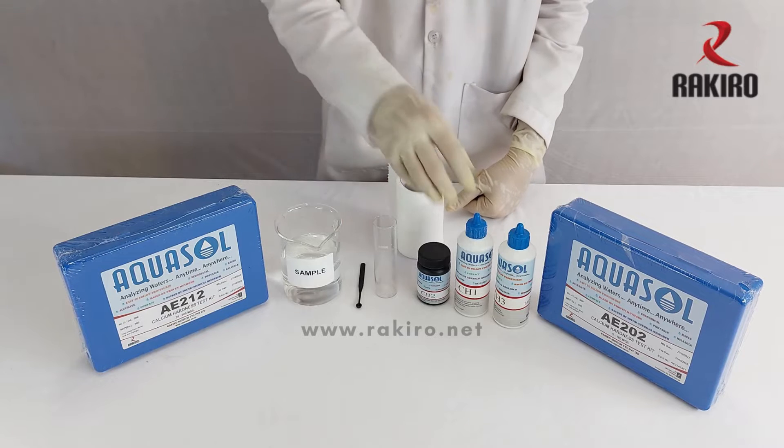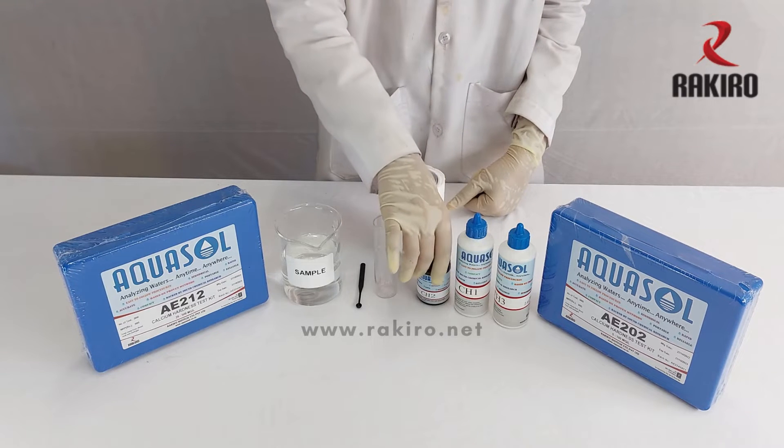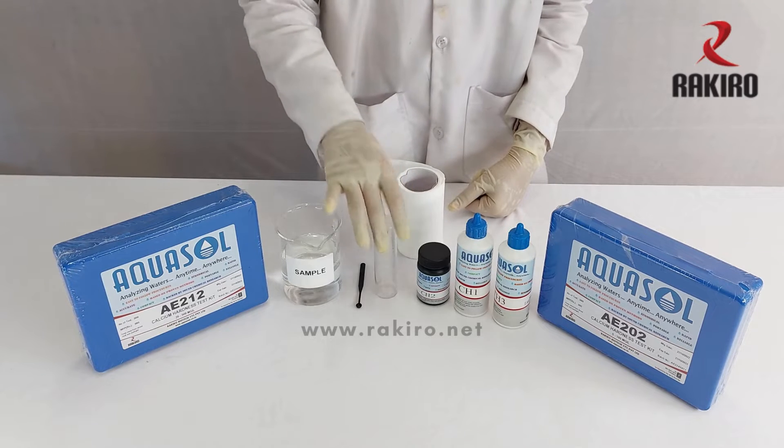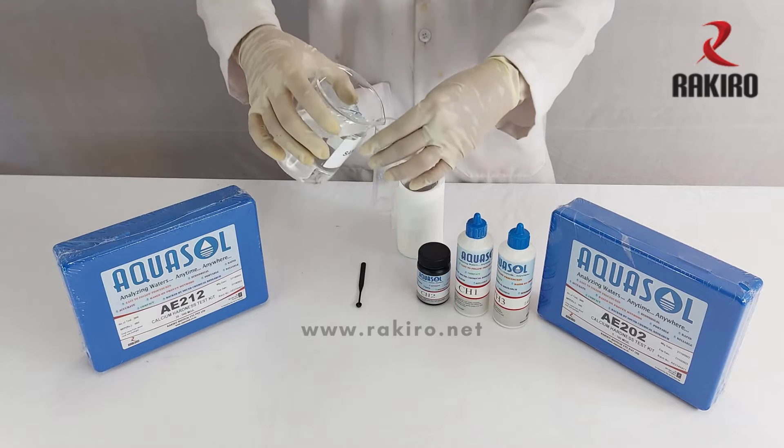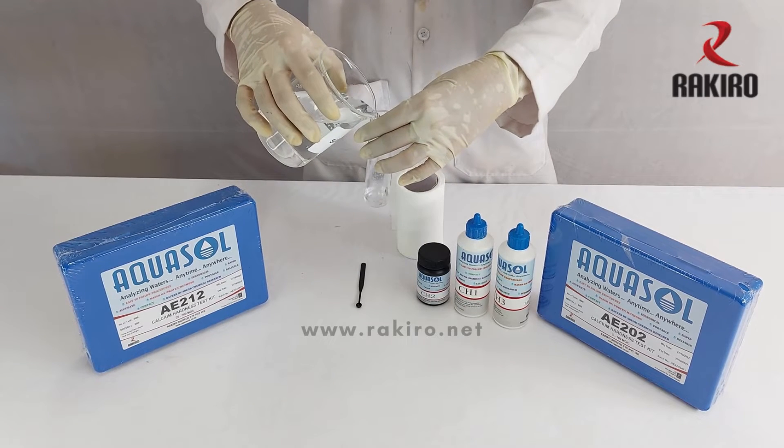The kit contains reagents CH1, CH2, TH3, a test jar, and a spoon. Take the test jar and fill the sample up to the 10 ml mark.